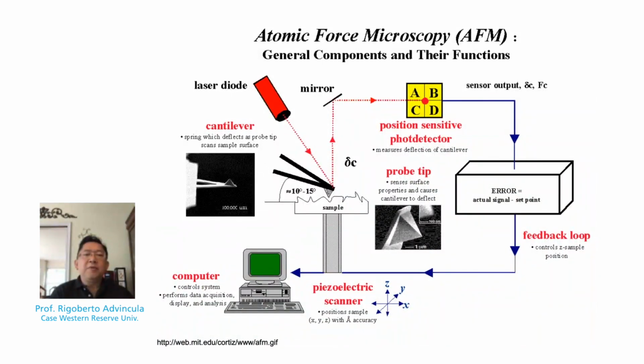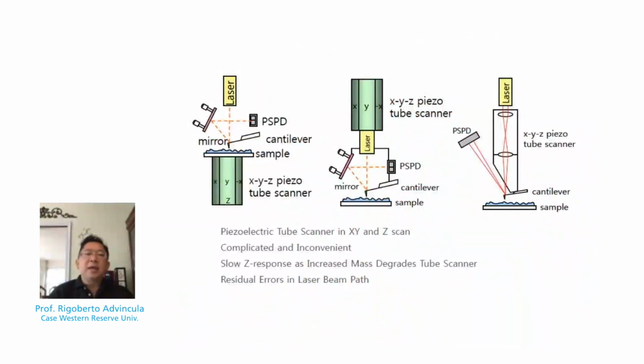Probe tip can be made to be very sharp, or it can be made to be very sensitive, but the position or deflection of the tip or simply movement of the raster tip can be sensitively detected in a position sensitive photodetector and thus recreated to form an image, which we can then observe as an AFM micrograph.